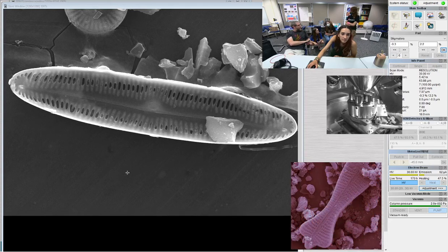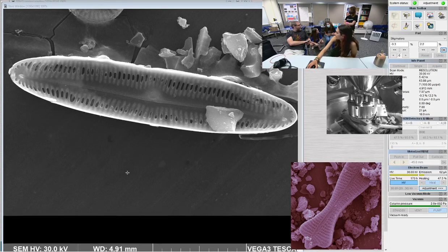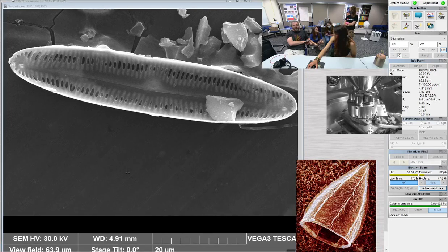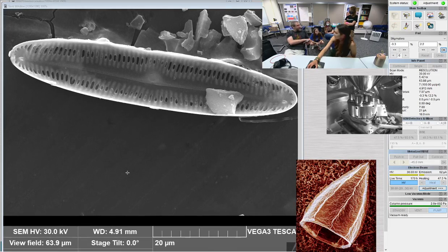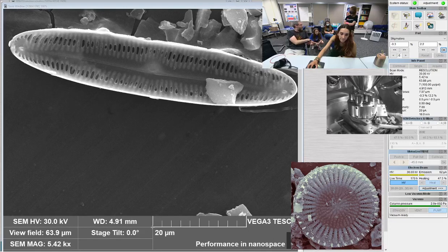It might be 100. If you haven't filled up a box, it's less than 100. But we have both partly filled. Oh, did you leave spaces where they were? Mm-hmm. Oh, that's what you guys were doing. I thought you just randomly filled out boxes. Them in order. Okay, so just try to find the next closest sample to it, if something is randomly missing, like there's everything else, but not that one that was on the list, and then make a note in the list.